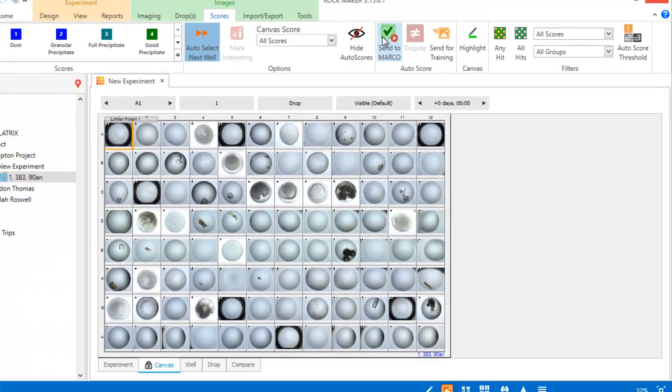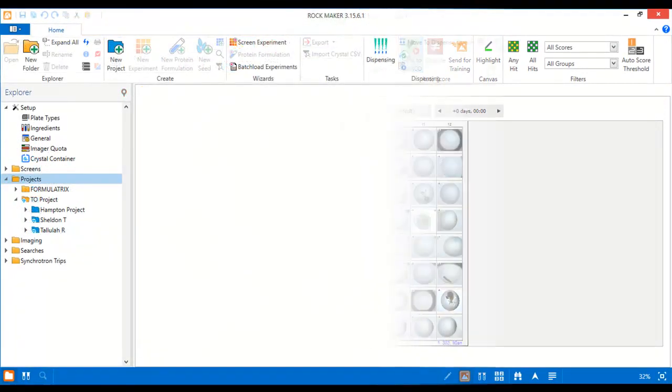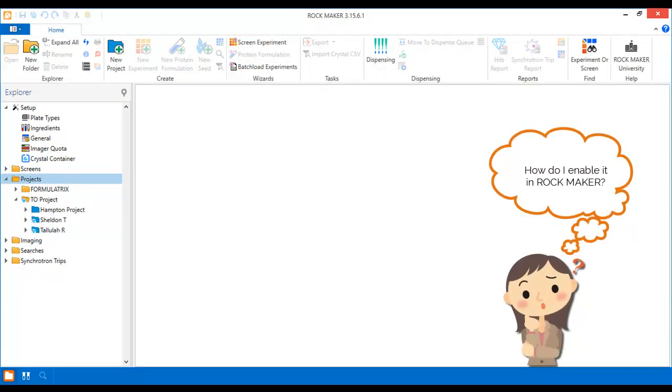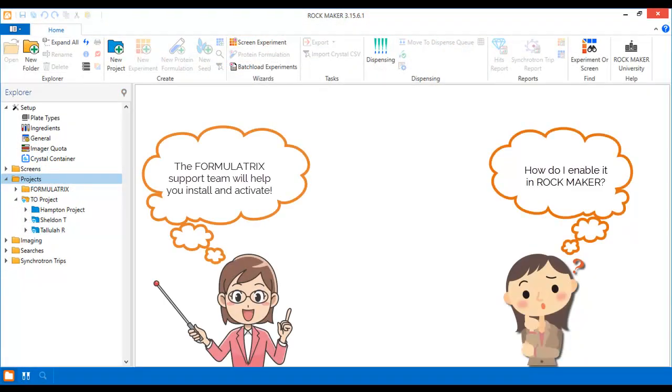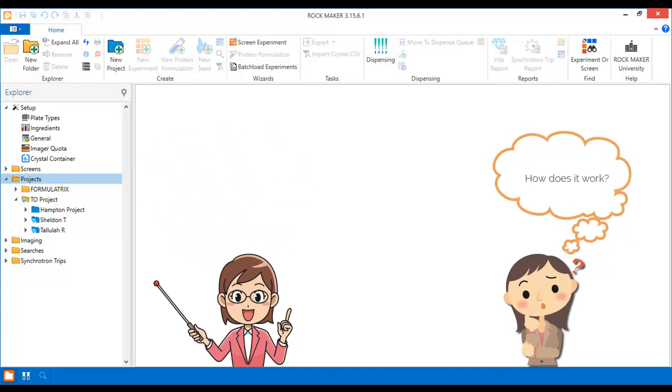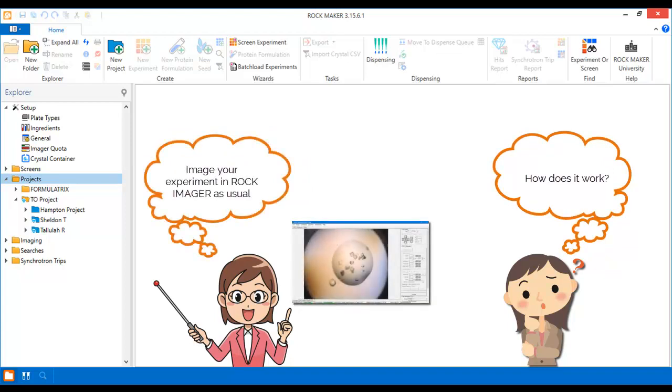Let's see how exactly Marco works in Rockmaker. Marco scores your images using a Linux application, which the Formulatrix support team can help you install and activate. Marco will run tirelessly from the moment it's up and running. Marco is fully integrated with Rockmaker, which makes working with it incredibly simple.